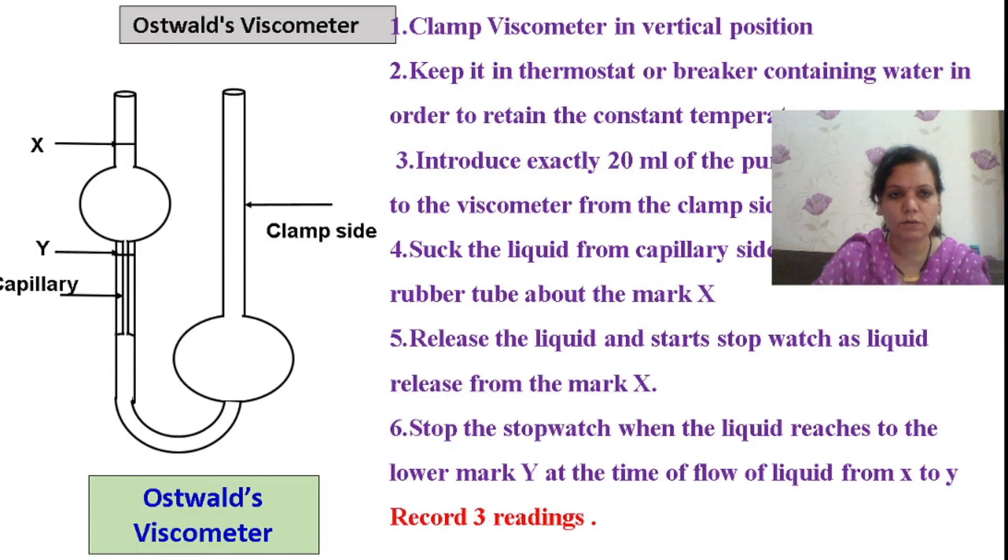We are going to utilize the Ostwald's viscometer. It is a glass assembly. We clamp this in a vertical position and keep it in a thermostat or beaker containing water to measure viscosity under constant temperature. We pour 20 ml of the solution from the clamp side. We utilize a rubber bulb to apply pressure and this liquid will move up till here, and the time of flow between markings X and Y we measure in seconds. We take three readings and use the mean for our calculation.